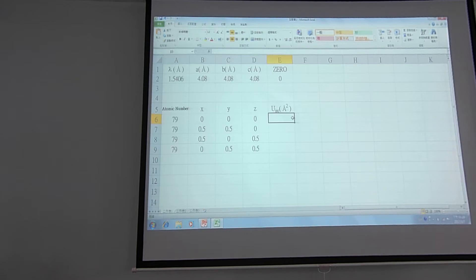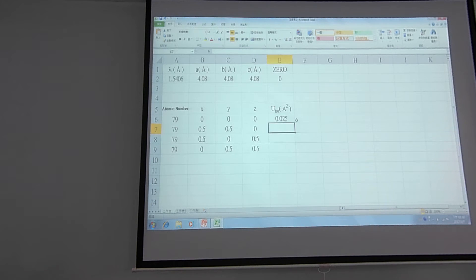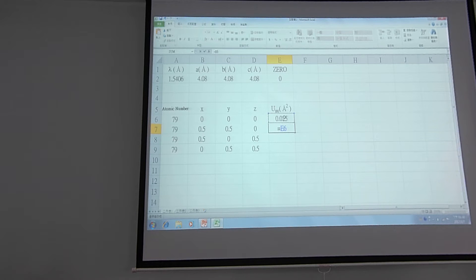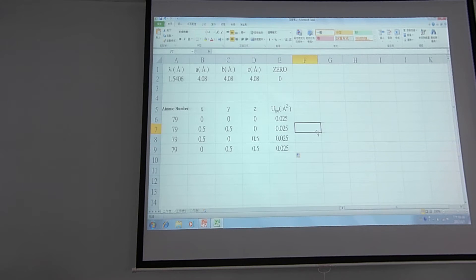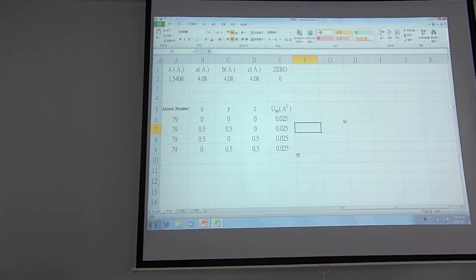We will put the default value of U_ISO equal to 0.025. We will let the next cell equal to the E6 cell — just type the equal sign and click cell E6, then press Enter. We drop and copy this so all four atoms share the same U_ISO value. These are the parameters that we will later refine in the GSAS program, but now you will manually build the diffraction pattern yourself, which is a very good exercise.